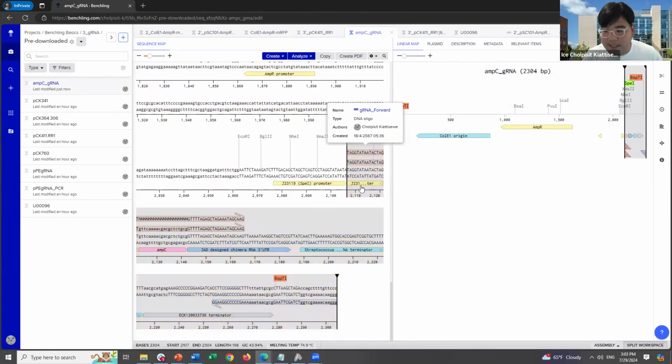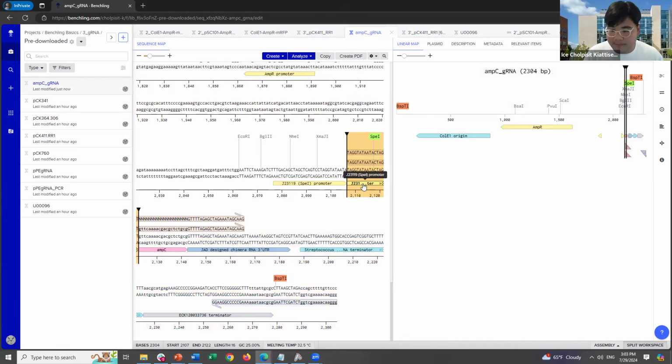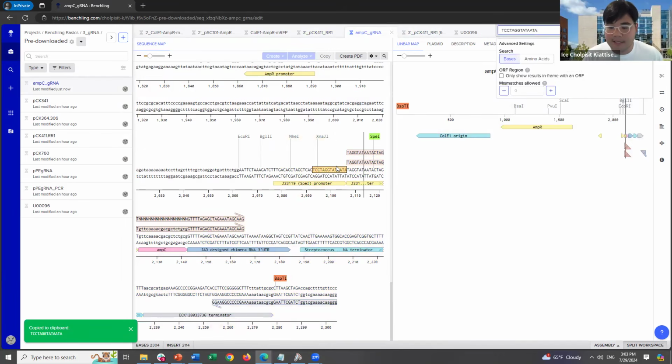So with this, you see that the annotation of this piece and this piece were a little bit similar. The reason is because this piece is actually complementary to this piece to a certain extent.